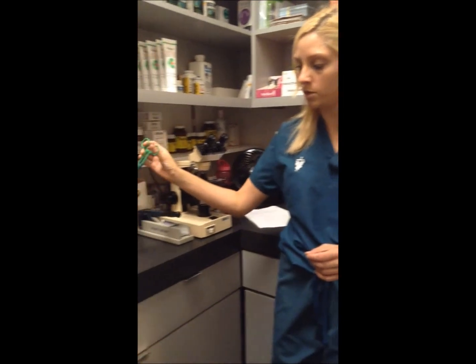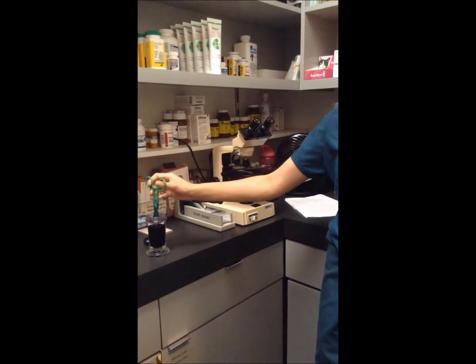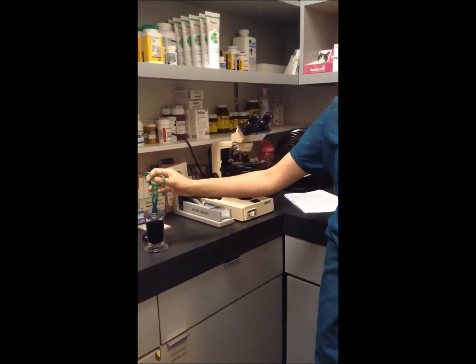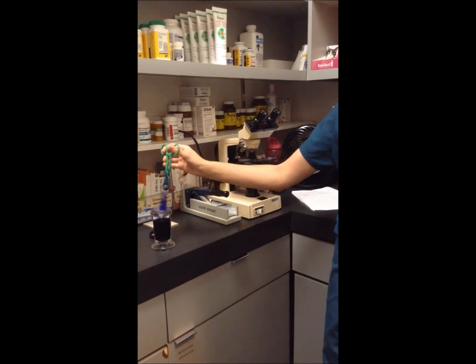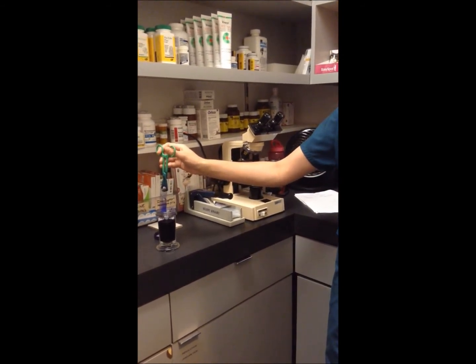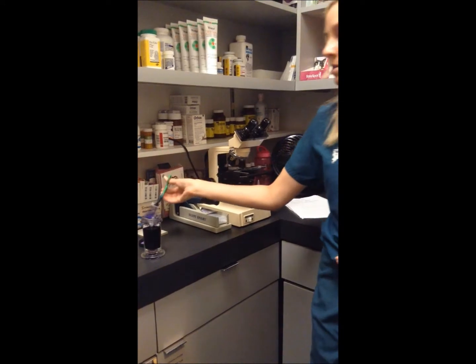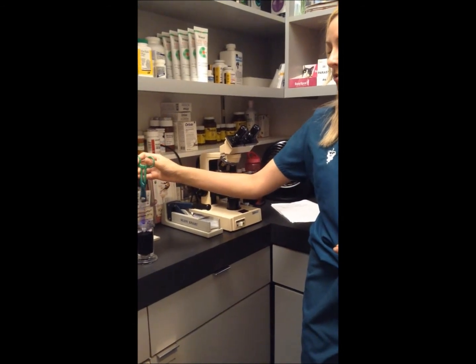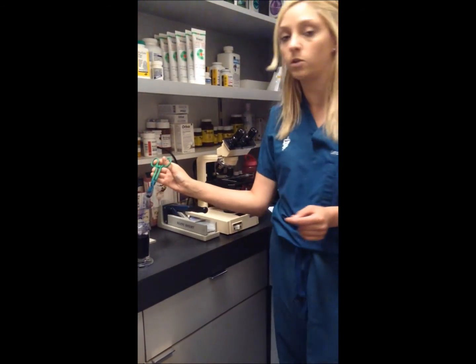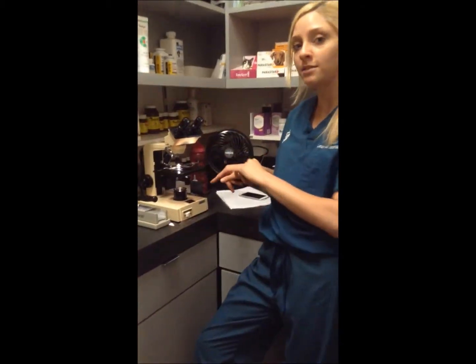Okay, so we're going to stain the vaginal cytology slide that we did. We're going to use the modified Wright's. You're going to leave the slide itself in there for about 10 seconds. Then you're just going to rinse it off a little bit and allow it to dry. What we're going to be looking for on the slide itself are cornified cells. As the days progress, they increase about 10%, and when it actually reaches full estrus, it'll be 90 to 100% cornified cells.